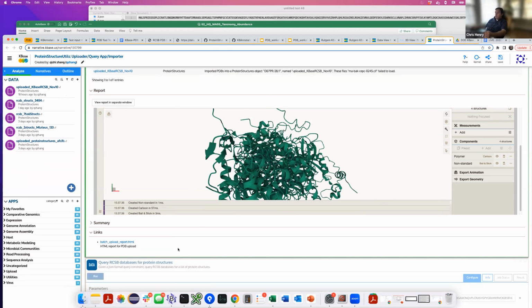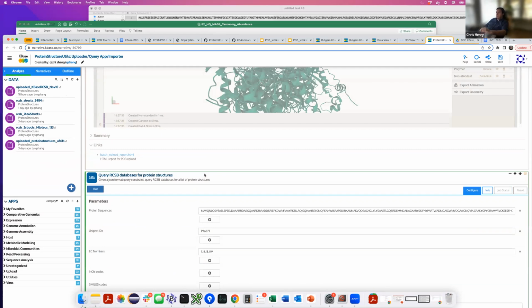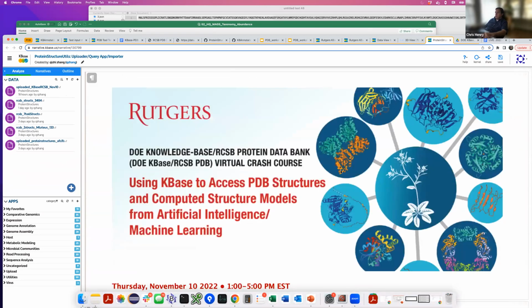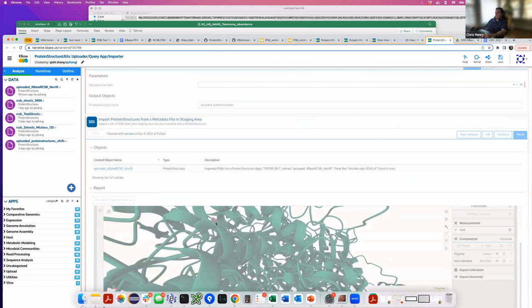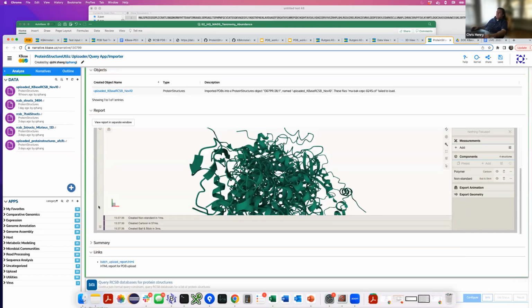And then when you do things like that structure alignment in PDB with the PDB alignment tools, screenshot the results and stick that in KBase in a markdown cell, much as we've done with this beautiful RCSB logo. Actually screenshot that into a markdown cell in KBase so they can see that result as well.